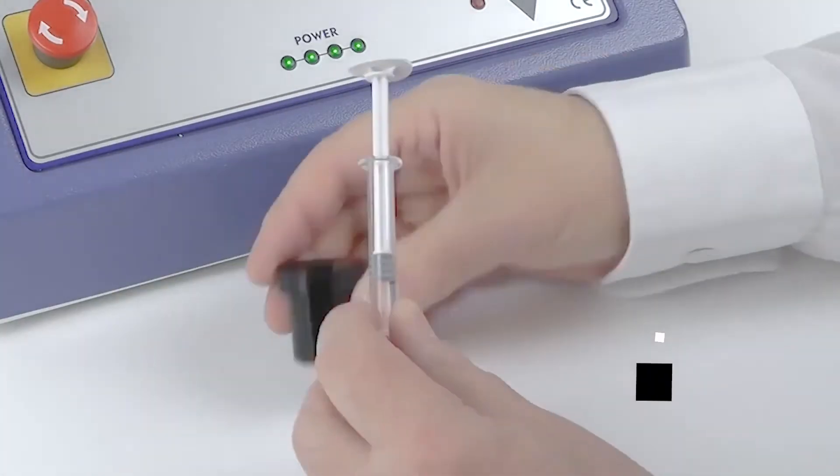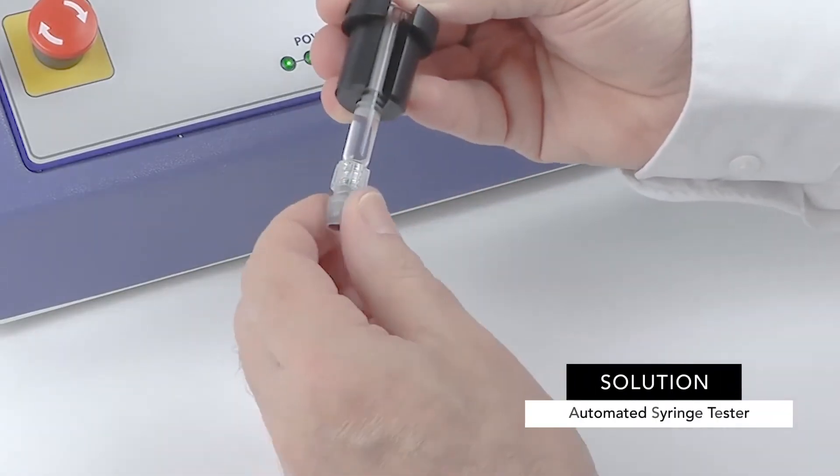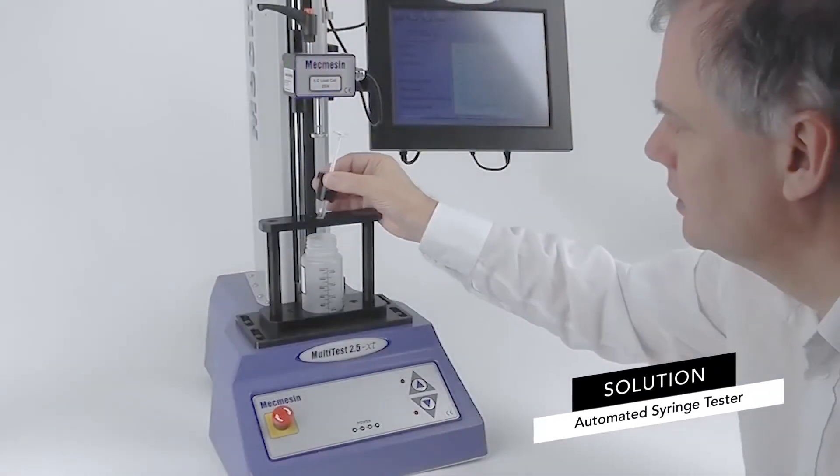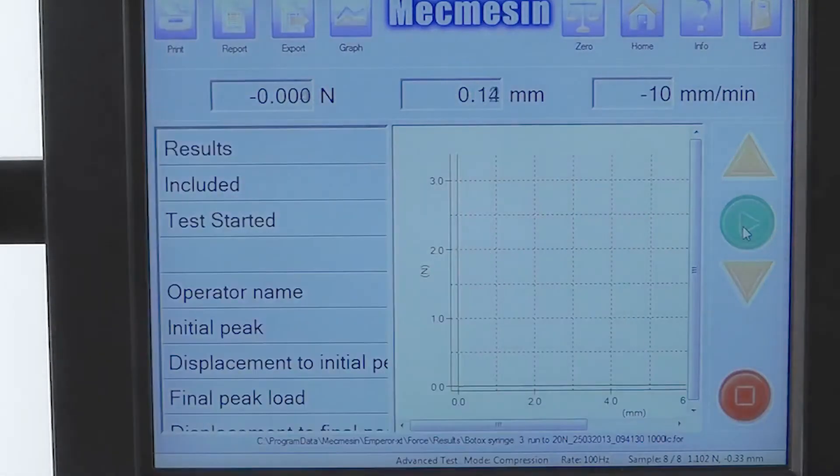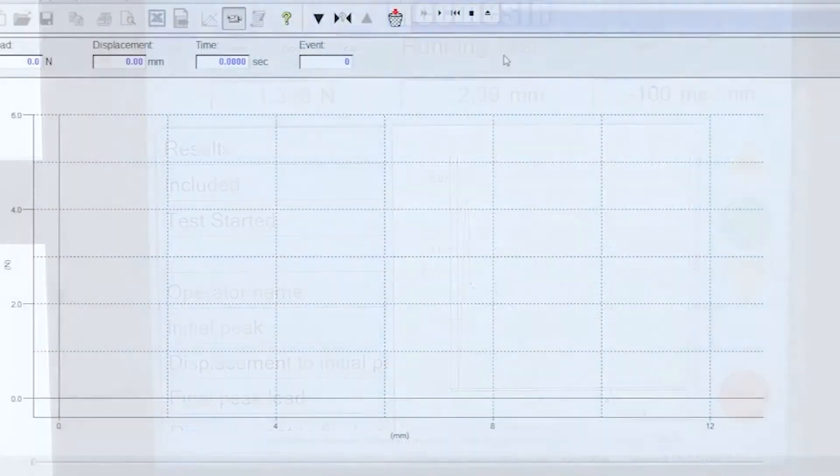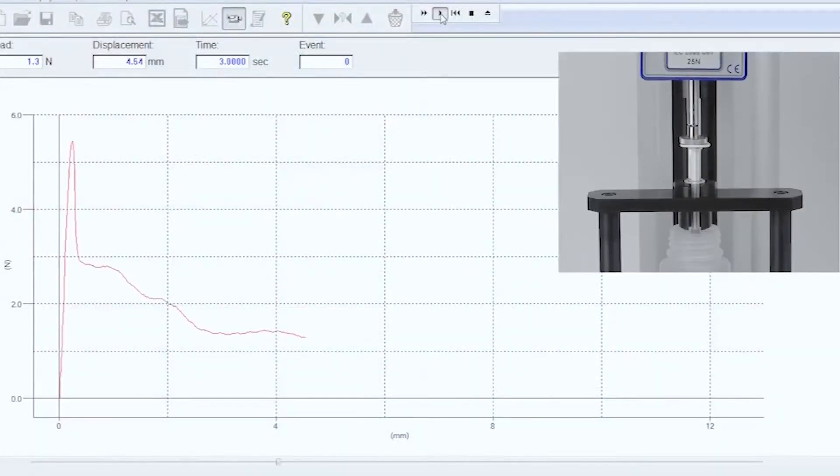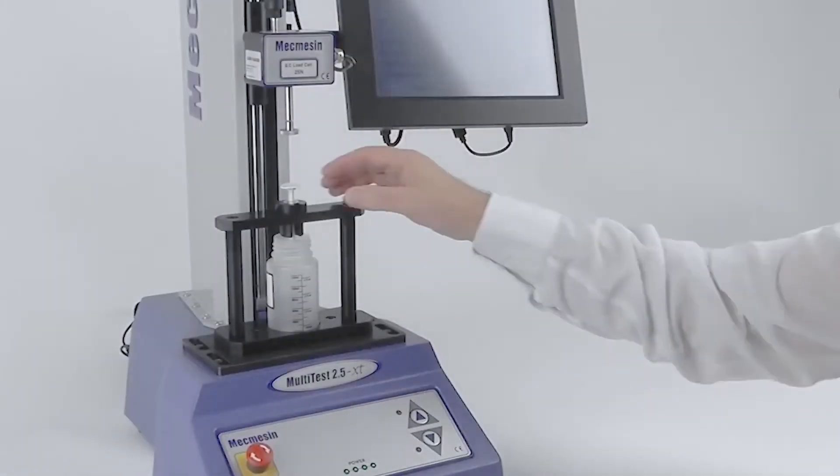Mecmesin offers a standalone test system for checking the break loose and glide force of an individual syringe. Operators manually load each syringe into the tester, start the test, and then unload the syringe when finished.